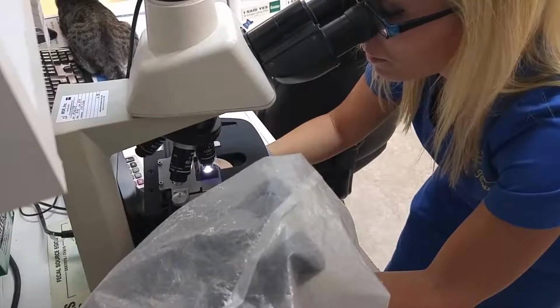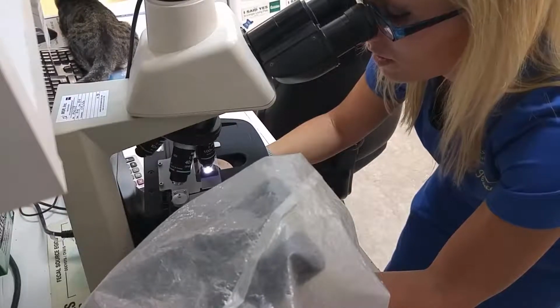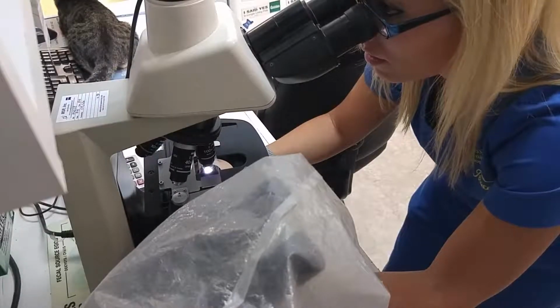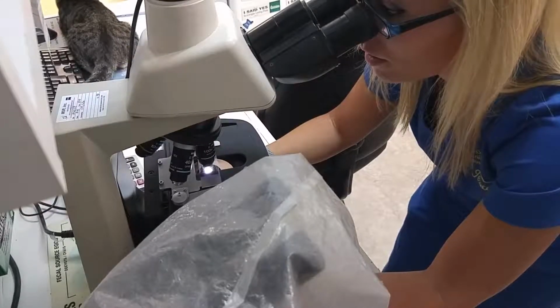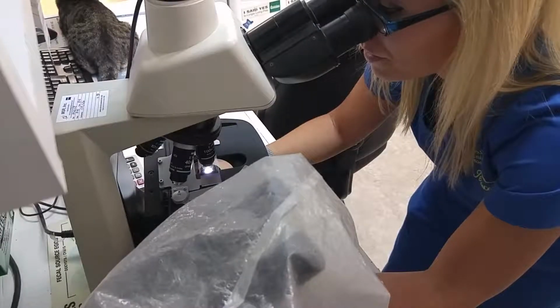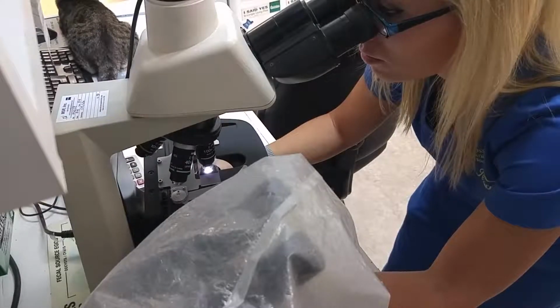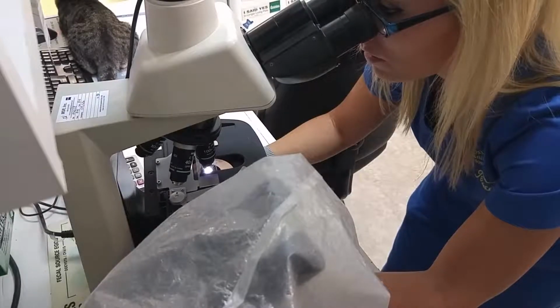Looking for is any bacteria or any yeast. Bacteria being either cocci or rod. And right now, not really seeing either. We suspect that this kitty might have a food allergy. He doesn't have a whole lot of discharge under the ears, but he's just scratching at them. But I do see a little bit of cocci.